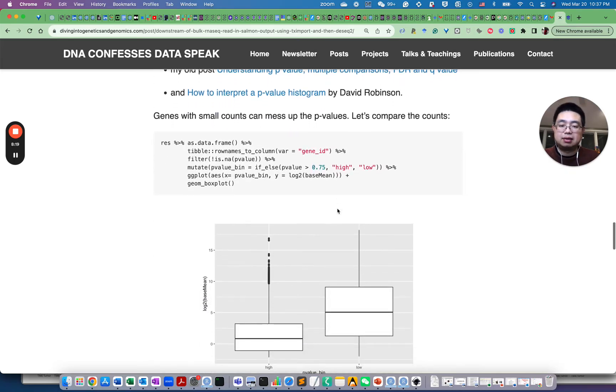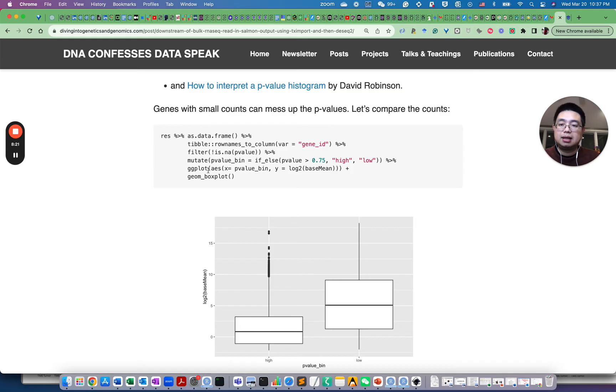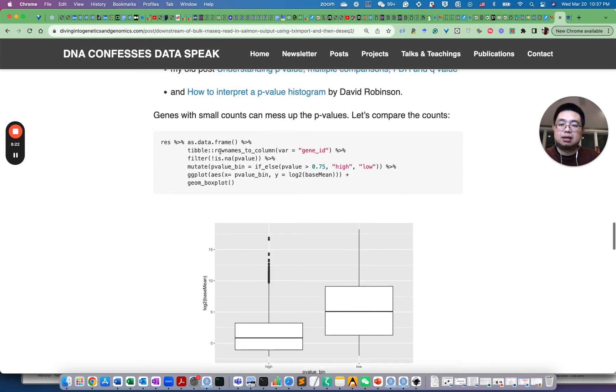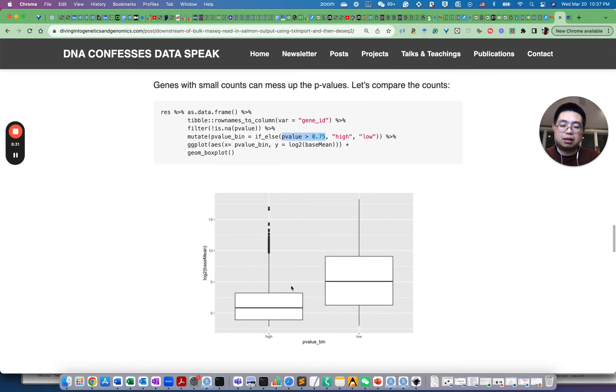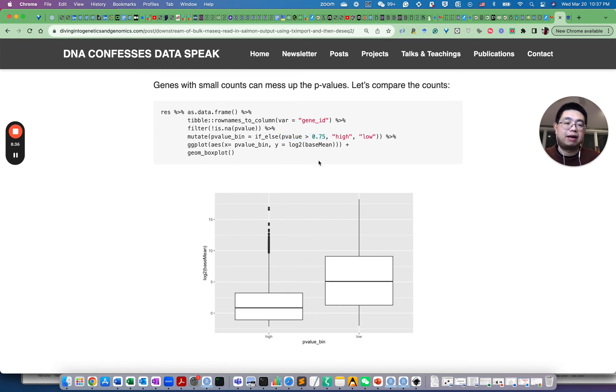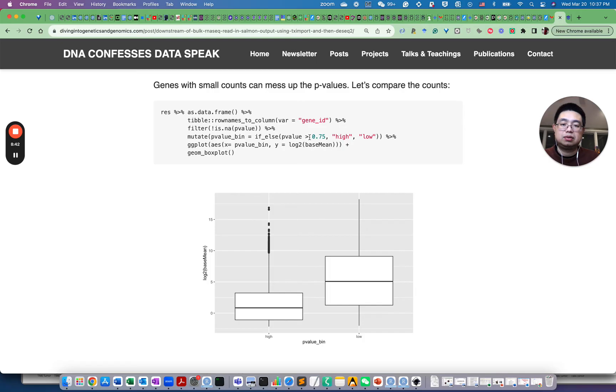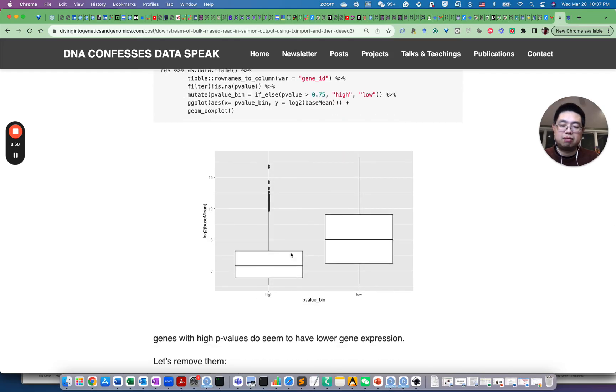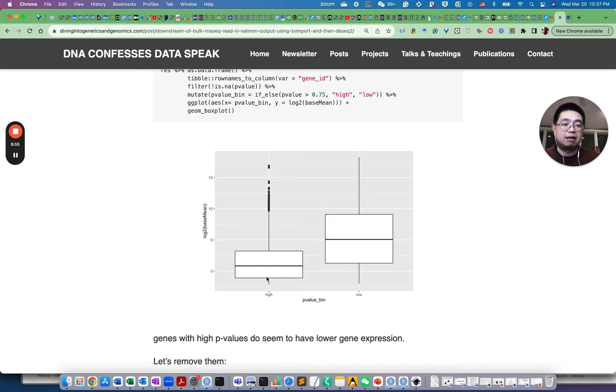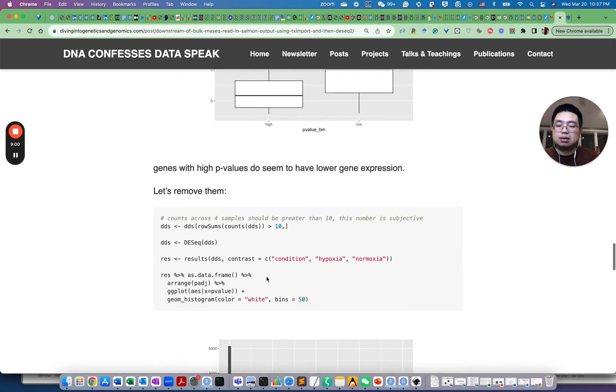And so what I did, I kind of categorized the genes based on their p-value. And then I plot their base mean, essentially the average expression level between those two groups. So for genes with p-value greater than 0.75, I see those are high p-value genes, those are low p-value genes. And it looks like they do have much smaller base mean, which means they have less gene expression.